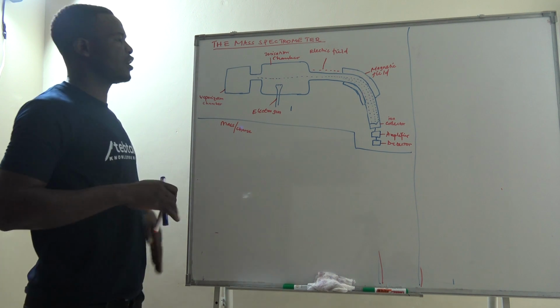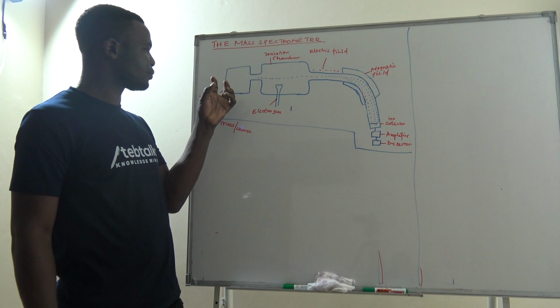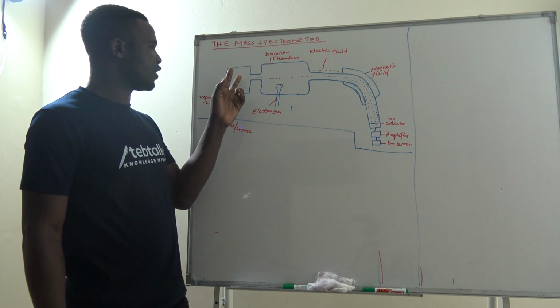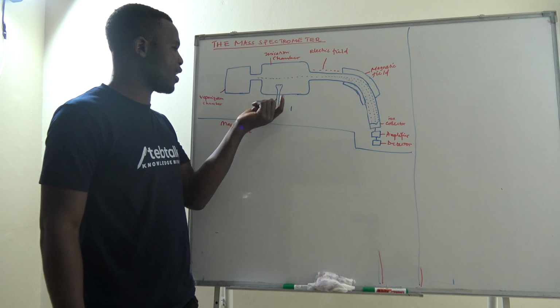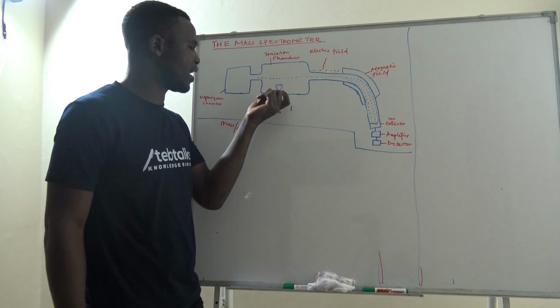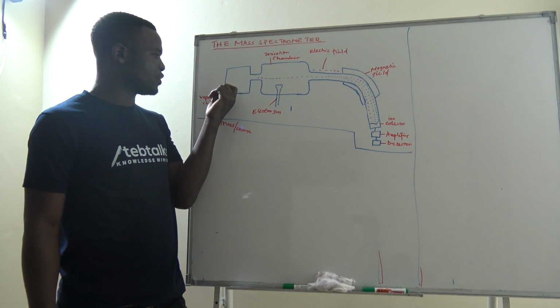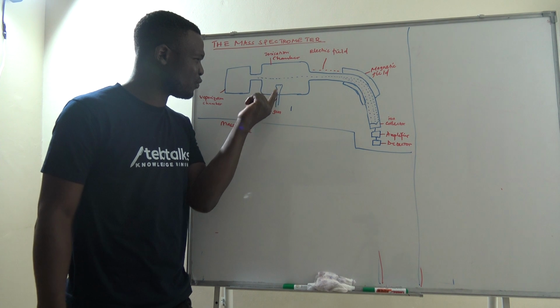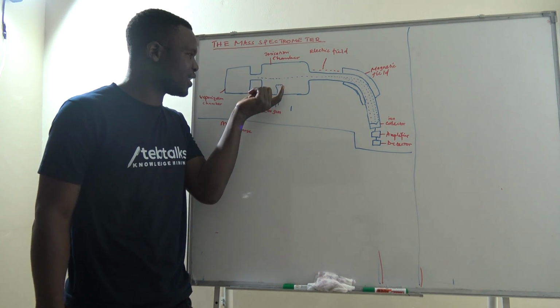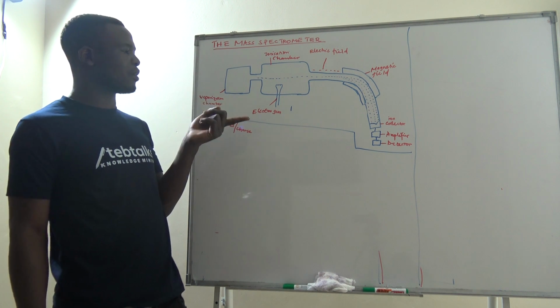Now, when the sample is a vapor, it comes into the ionization chamber where we have a hot filament or an electron gun. The gaseous molecules are knocked by the fast moving electrons that are produced by this hot tungsten filament that we are calling an electron gun.